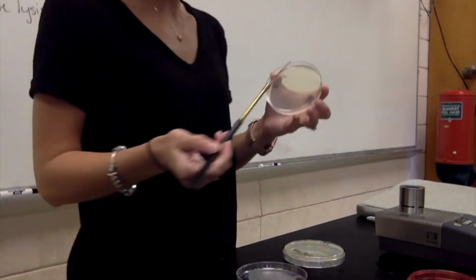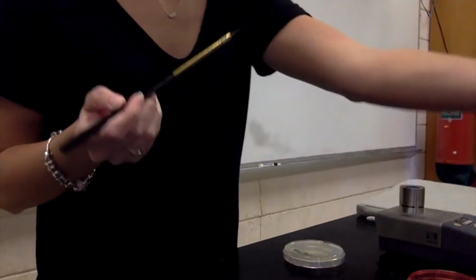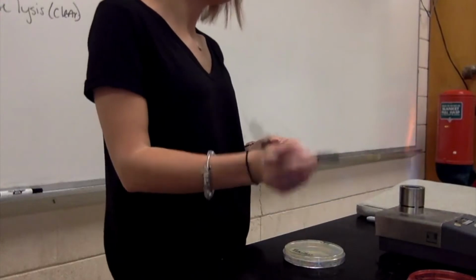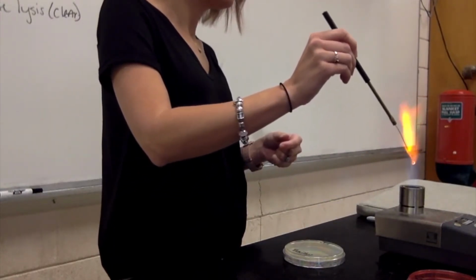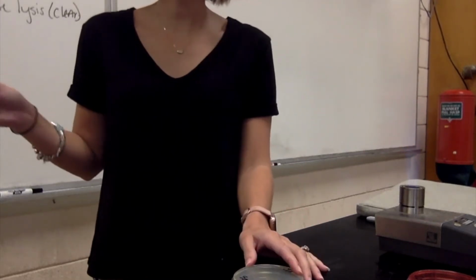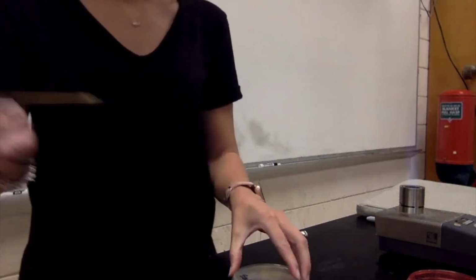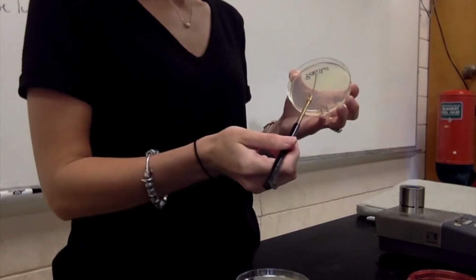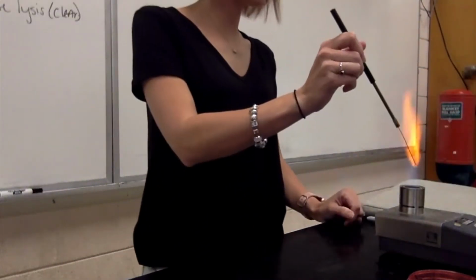So here's my E. coli. Let my loop cool some, and my Bacillus. Alright, I'm done with my gelatin and my starch.